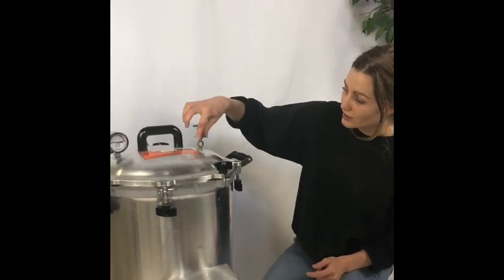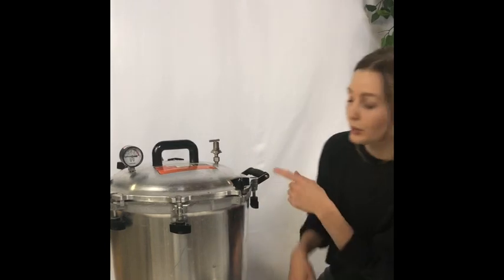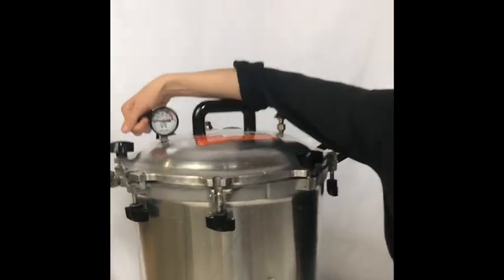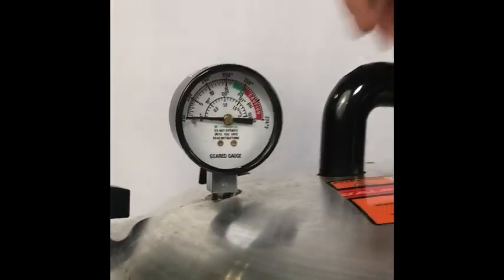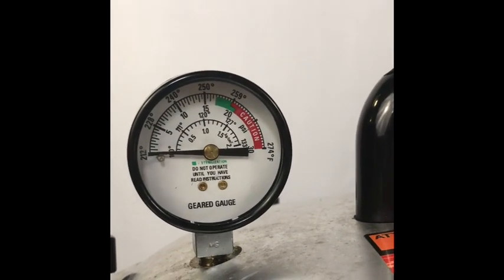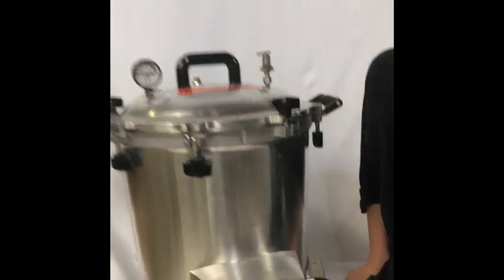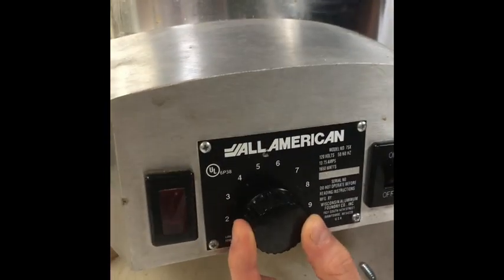When you are releasing the steam, it's pretty loud and hissy and a bit scary, but fear not — everything's fine, it's supposed to sound like that. There's also this little skirt over here, so all the water that comes out will be pushed down. As long as you use common sense, you're not going to get hurt. The second time you bring it up to pressure — or the first time if you're not doing a purge — you want to wait until this needle gets into where the green and red cross over, which is right about 20. That's where the action happens, and that's what All American recommends.